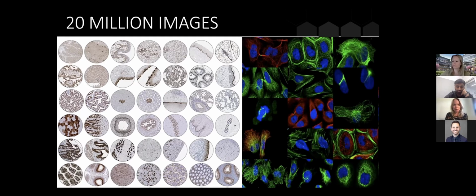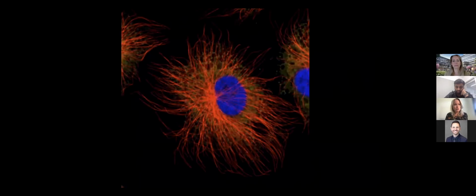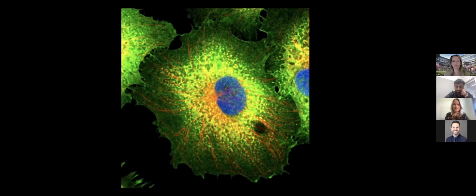And for this purpose, we wanted to have an automated pipeline so that we can localize proteins with high resolution. And we decided to go with just regular oil immersion confocal microscopy that we automated ourselves, and also automated the sample preparation pipeline. So we have DAPI for the nucleus. We have antibody-based markers for microtubules and the endoplasmic reticulum, both to be able to quality approve the fixation, but also for computational purposes and getting a nice outline of the cell. And on top of this, we add HPA antibodies to systematically localize human proteins one by one.